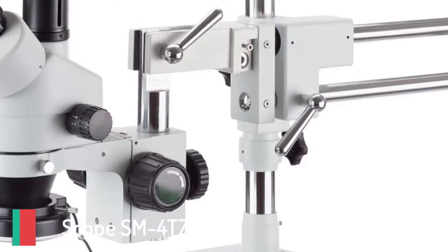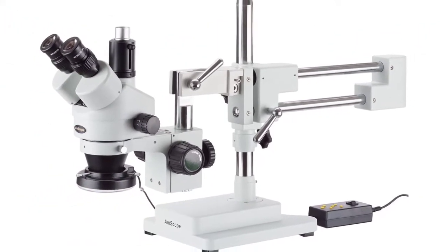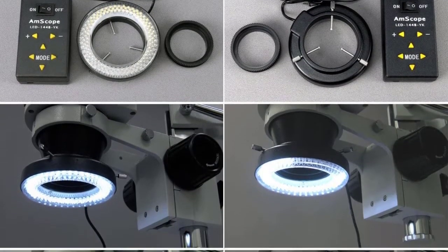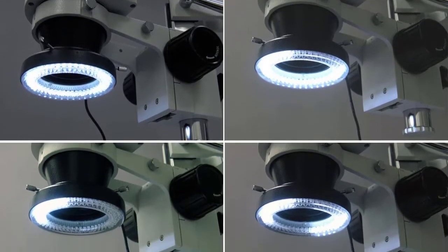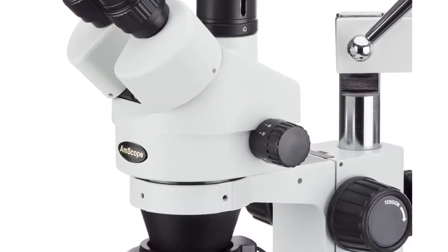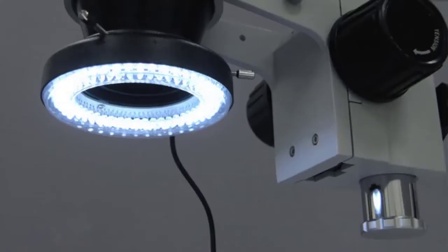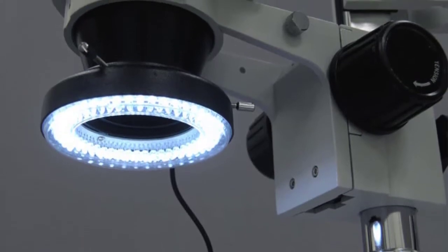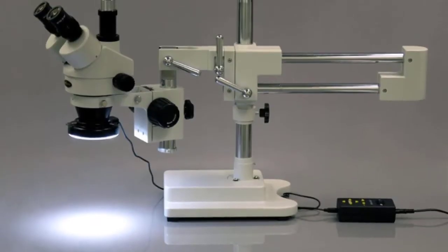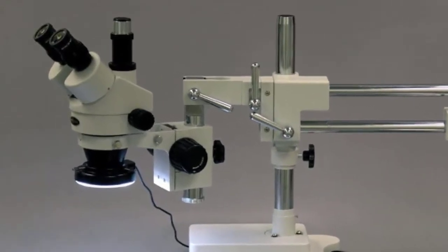Number two: AmScope SM4-TZ-144A professional trinocular stereo zoom microscope. WH10x eyepieces, 3.5x-90x magnification, 0.7x-4.5x zoom objective, 4-zone LED ring light, double arm boom stand, 110V-240V, includes 0.5x and 2.0x Barlow lenses. Light source type LED, color white, real angle of view 45 degrees, maximum magnification 90x.